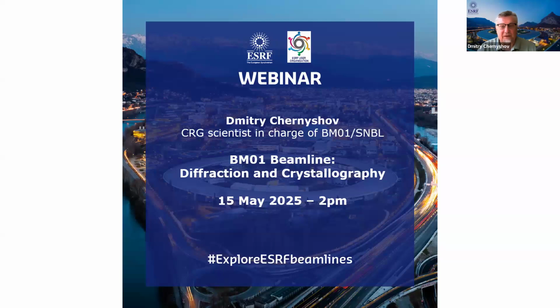First of all, I would like to thank ESRF for this opportunity to tell about our CRG beamline. For those people who regularly watch these webinars, you know that there are two types of beamlines at ESRF, and I belong to this collaborative research group, the Swiss-Norwegian beamline. I'm not going to give you many details about the technicality of the beamline, flux, etc. I think the best illustration would be just to show what we're doing.